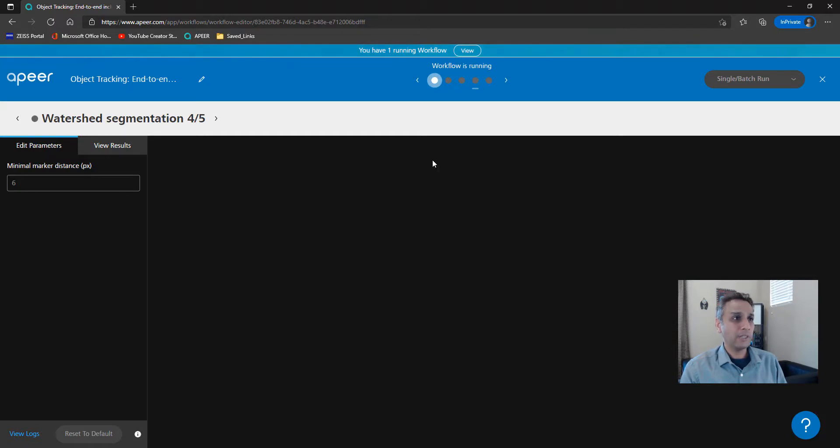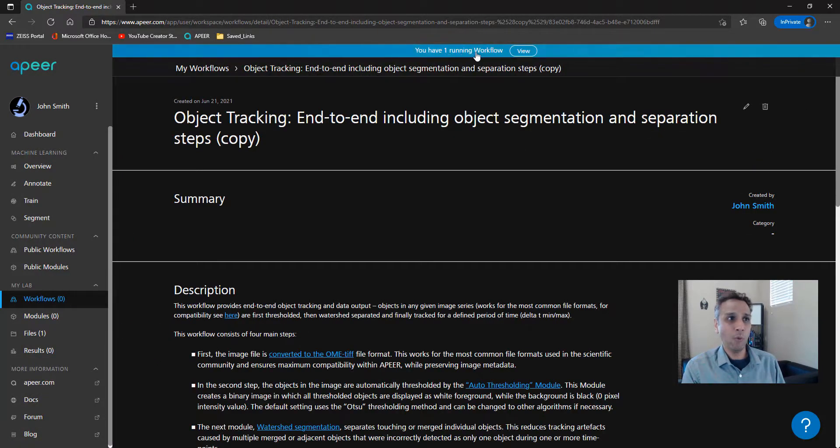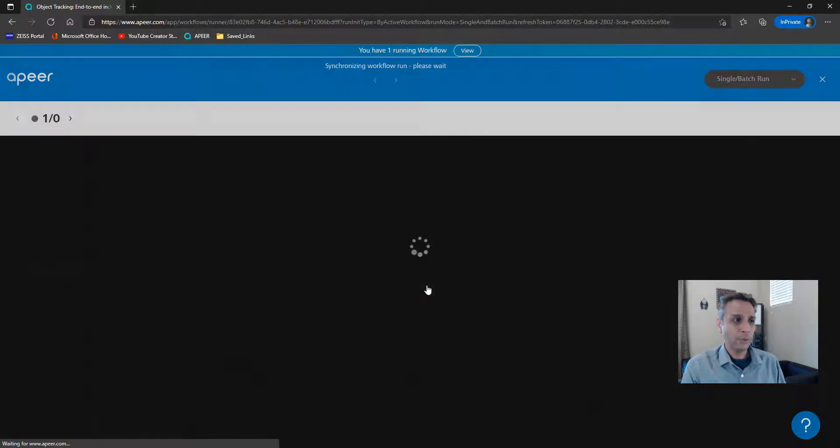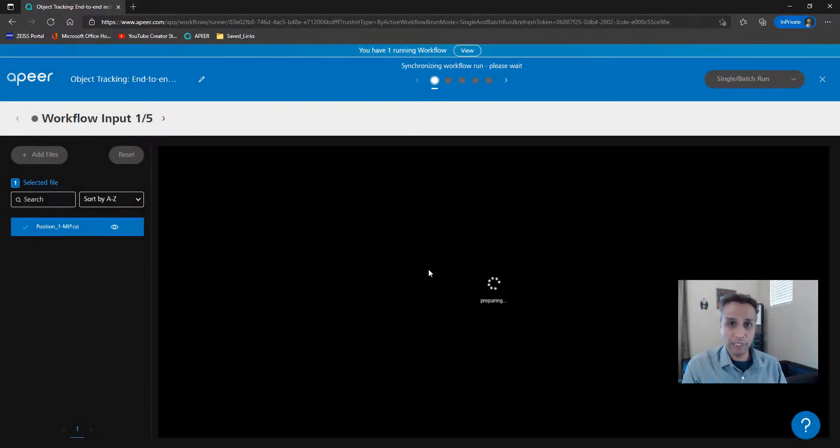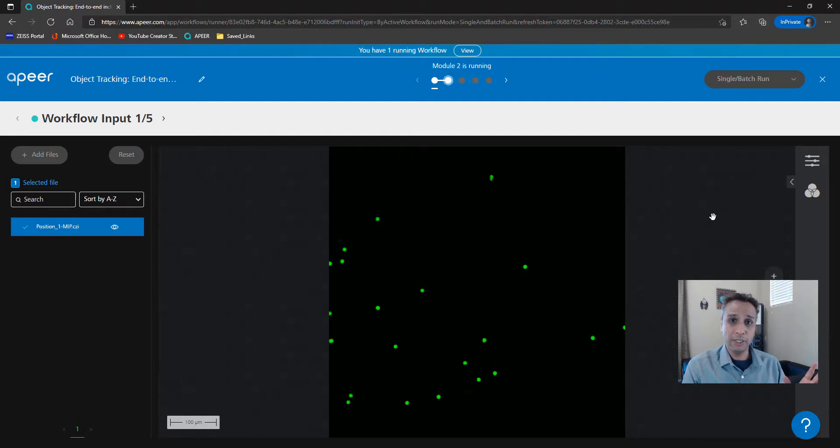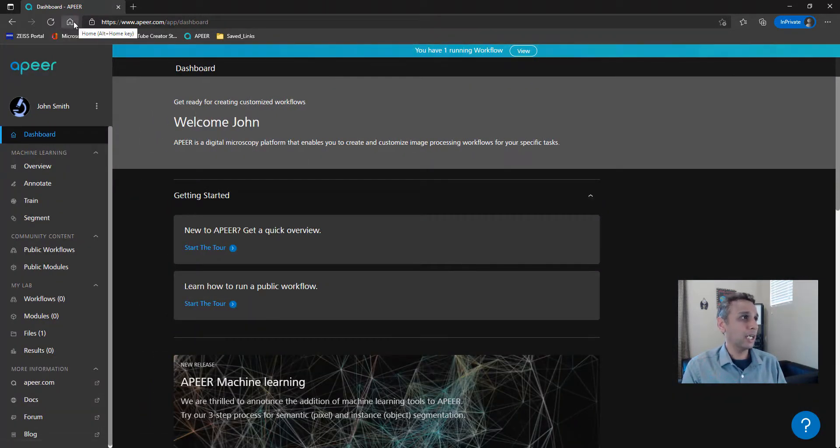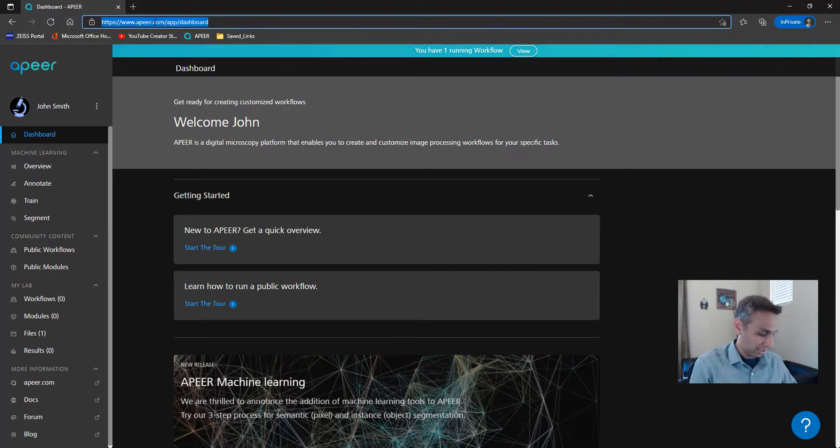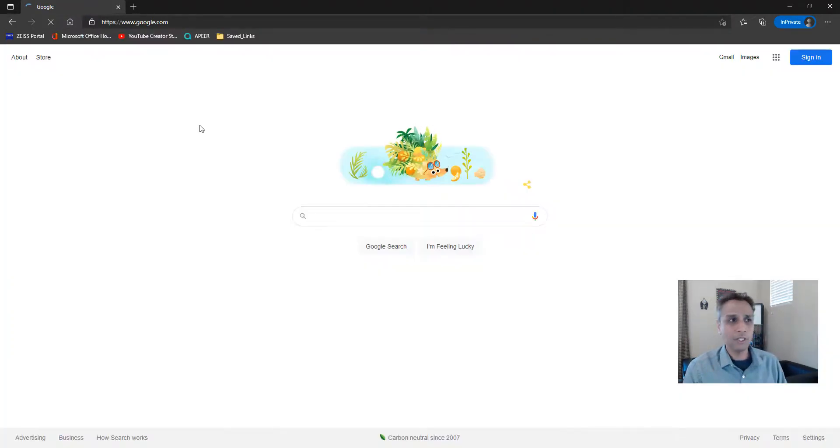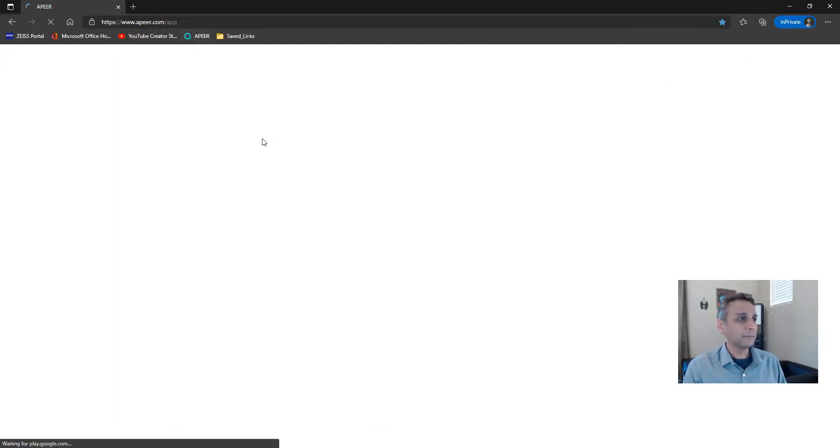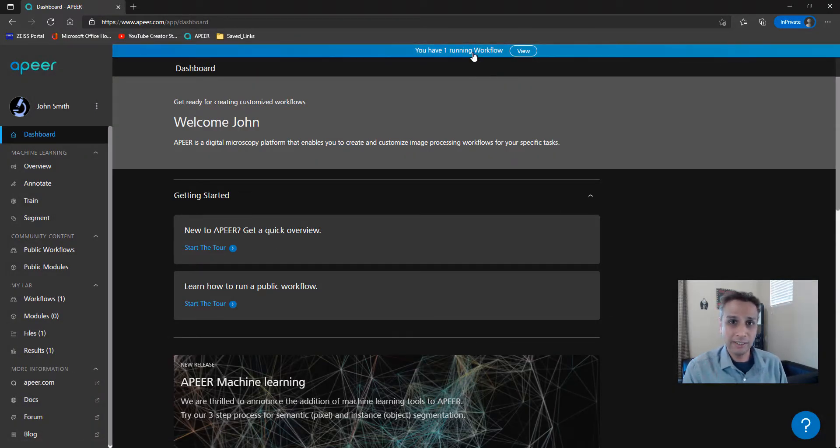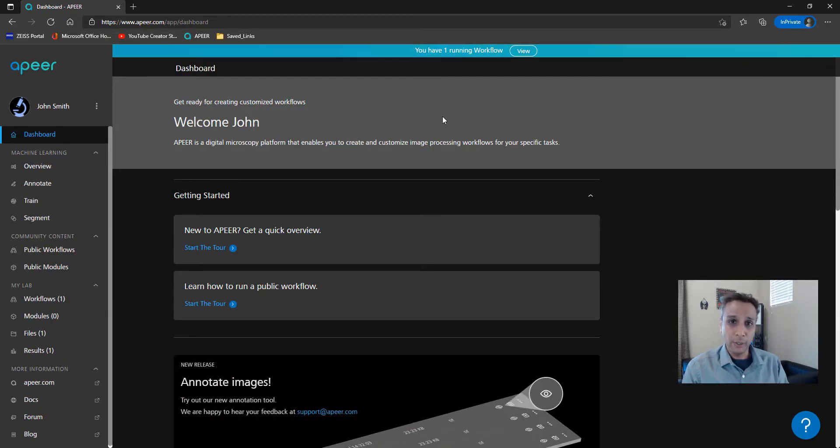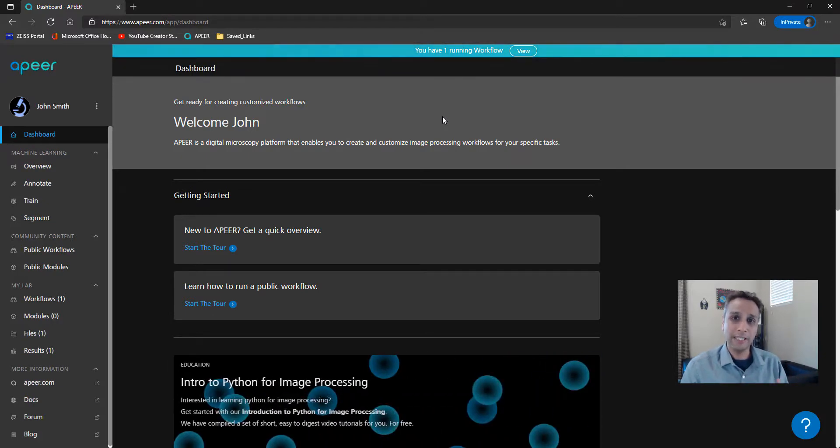Now let me show you a couple of things while it's running. We don't have to stare at the screen. I can exit out of this window, and as you see, I still have one running workflow. You can always view and click on this, which takes you back to this page where the workflow is running. The whole point of doing things in the cloud is it makes things very flexible. You're not tied to your workstation. You can go ahead and even close this Apeer browser and go somewhere else. Let's navigate out of this Apeer browser. Now let's go back to Apeer. The workflow is still running. At this point, let's pause this video and I'll continue as soon as the workflow execution is completed.